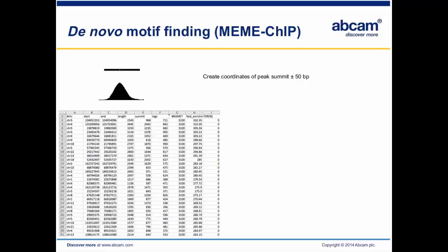Now I need to clarify two terms before we go any further. When MACS is used for peak calling, peak means the whole enriched region from start to end, indicated by the black bar on the top left, while summit, indicated by the thin orange line, means the highest pile-up point within the peak region. It is supposed to be the exact TF binding site.